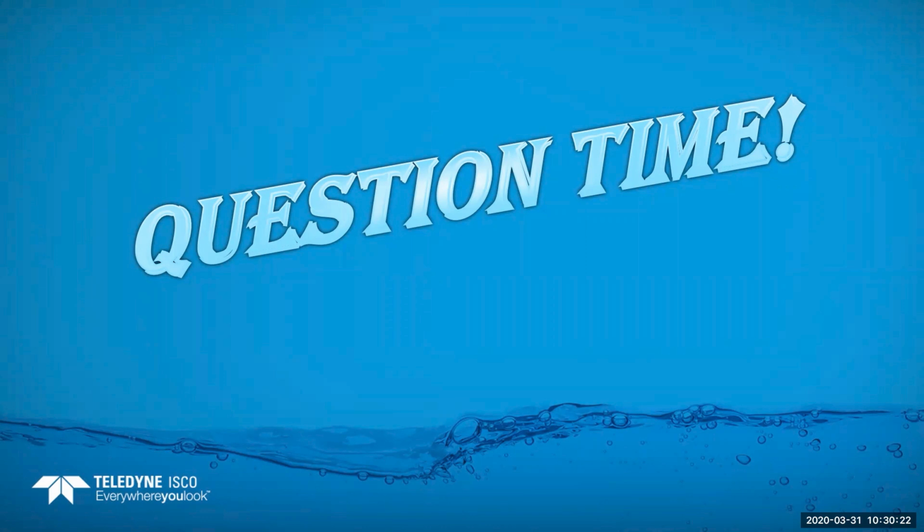Russ asks, are there other tips to prevent overflowing the sample bottle during high flow events? That's where knowing what your flows are during the day is very important. If you know what the max flow is that you will ever get, then you calculate the number of samples and how much sample you want each time, based on that.